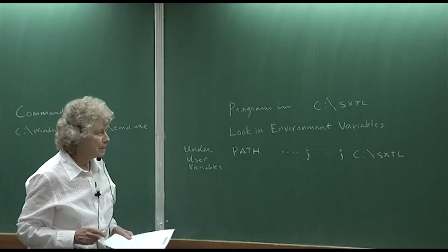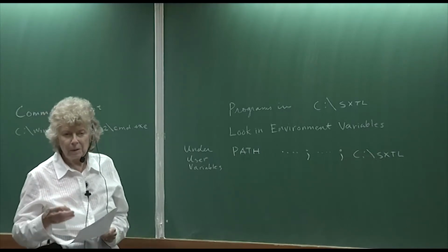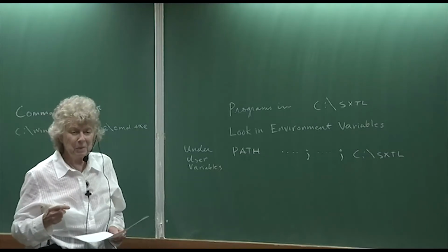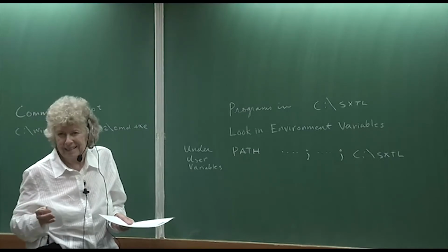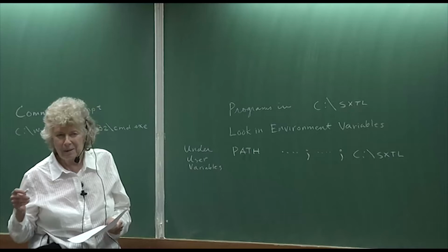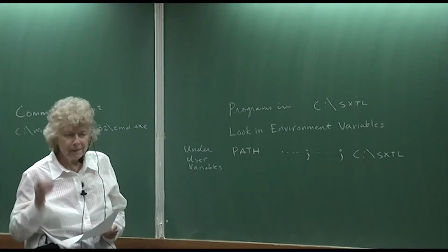So sorry that this is so technical. There's one other thing, though, that I recommend, and that is that you don't hide file extensions. For some crazy reason, the default in Windows is to hide file extensions. But we don't want to hide file extensions. We want to see them, right? We want to see if it's HKL or INS or RES, all the file extensions. We should be able to see them.